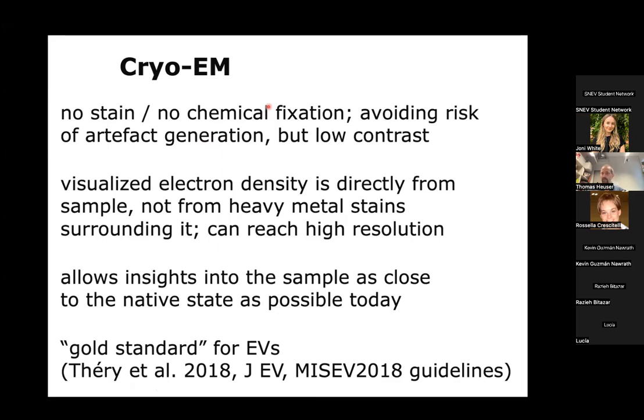So in cryo-EM, we're not using any heavy metal staining. We're not fixing our sample. We're not removing the water. So we're just taking the sample and we're freezing it as fast as we can. And this minimizes any of the drying artifacts, staining artifacts I mentioned before.